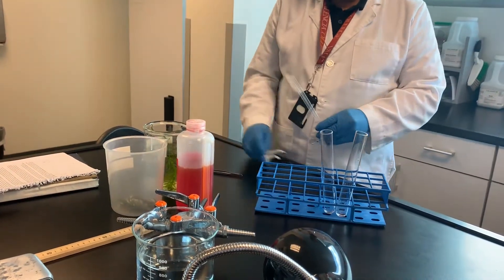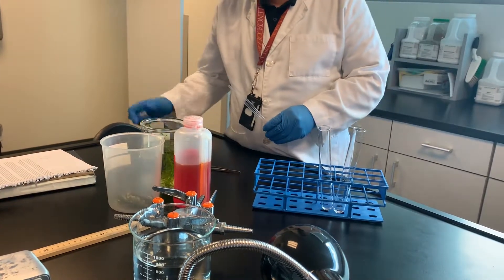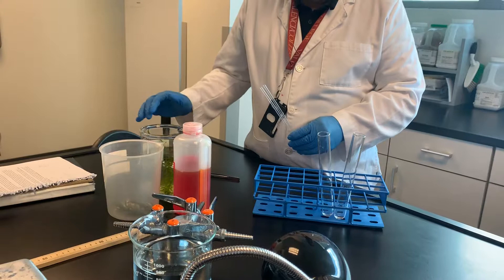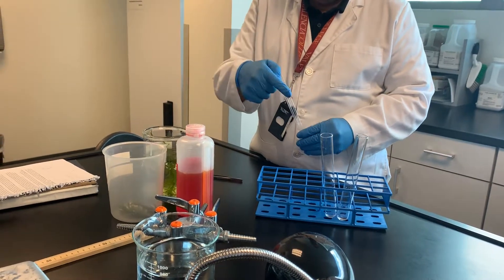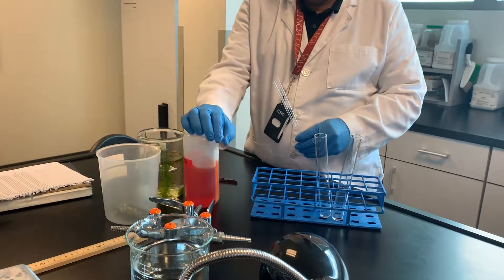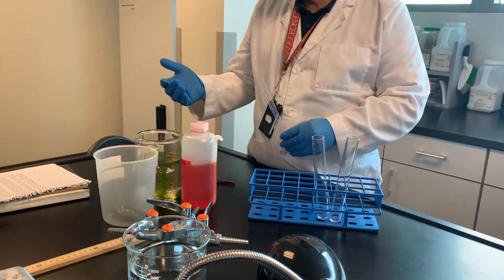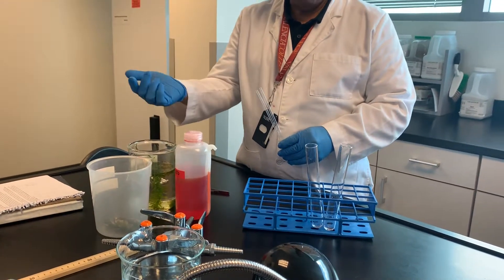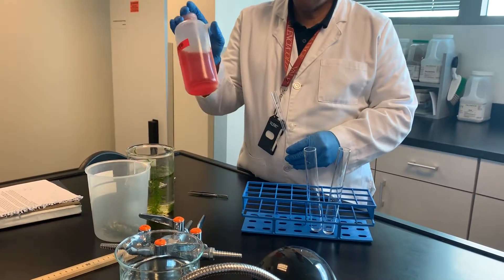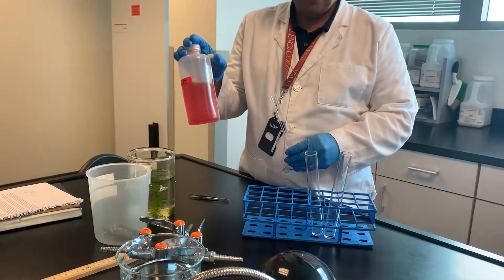What color did it change when we bubbled CO2 through it? Yellow. Because when you bubble CO2 through phenol red — which is mostly water — you get carbonic acid produced, and the carbonic acid drops the pH. This is a pH indicator; it turns yellow under acidic pH.